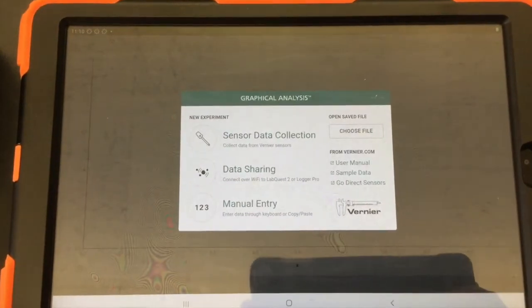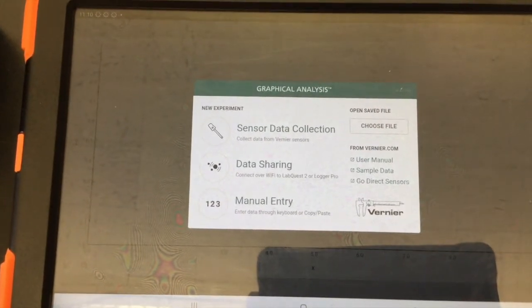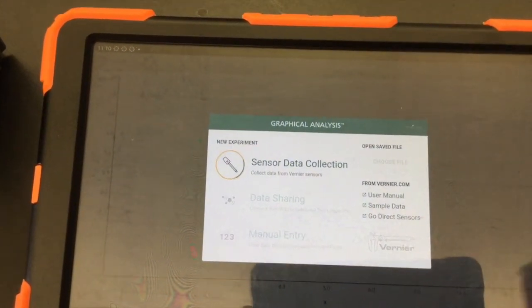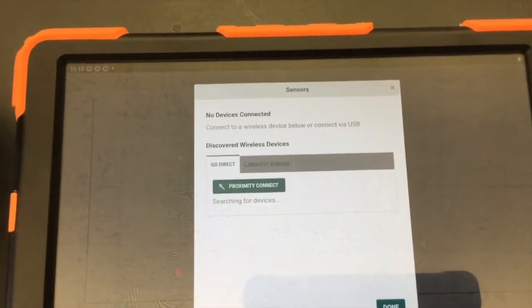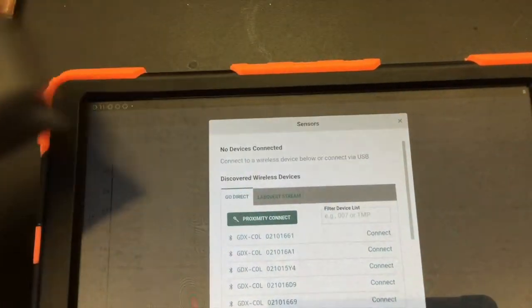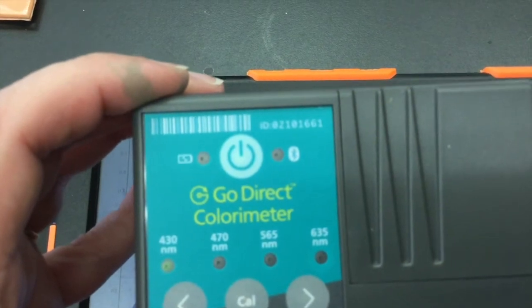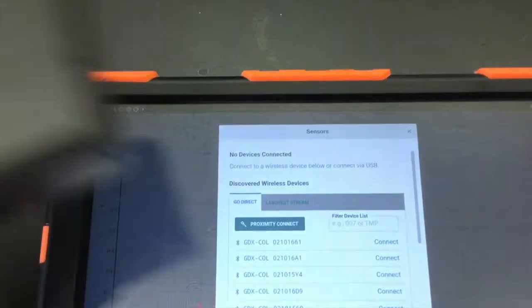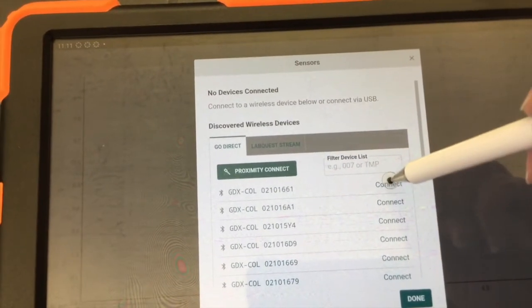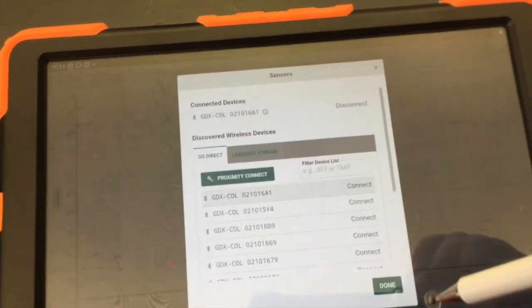When you open graphical analysis you should see a screen like this that asks you how you want to collect your data. We are going to use sensor data collection. You need to make sure that the colorimeter you are using is turned on so there is a power button right here and the light should be blinking. Right above the blinking light there is a number you are going to match that ID number to what is on your screen. In my case it is this first one. I am going to connect it. It should appear at the top here. And then I say done.